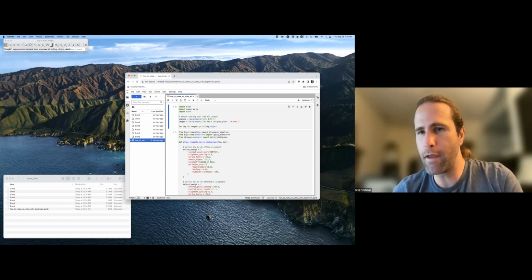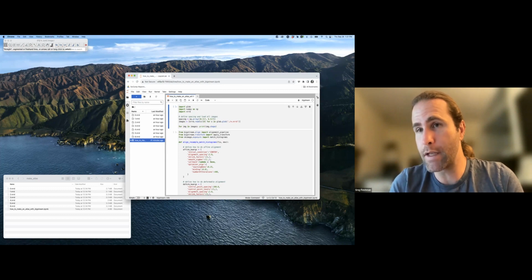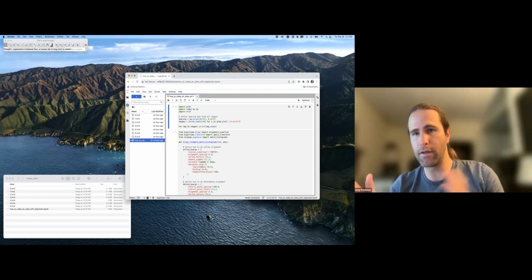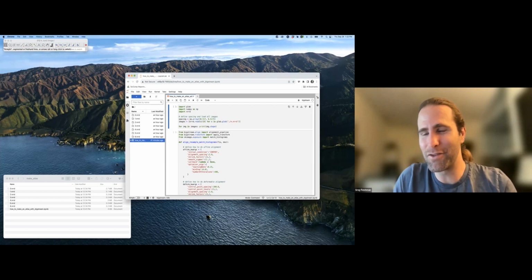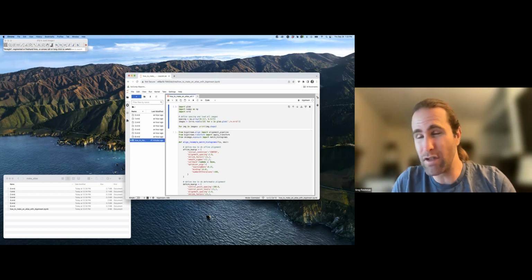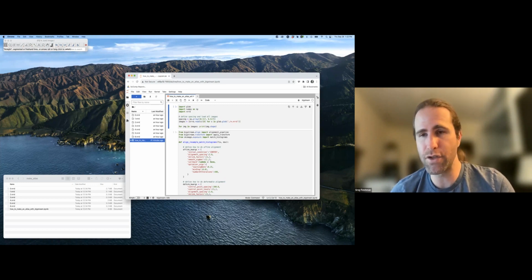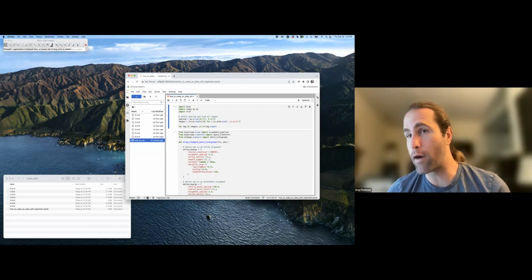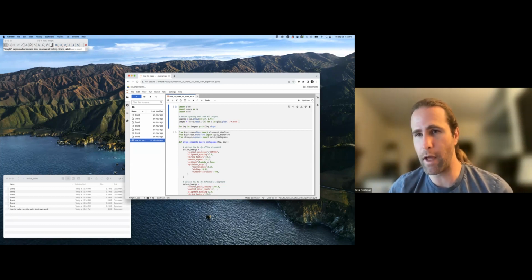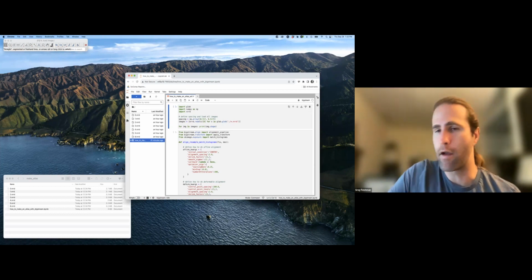And I think if I'm interpreting your question correctly, that process is one where you have to bin things. You have to decide how many bins to use for your histogram. I don't put that much thought into it, to tell you the truth. I just use the default settings for histogram matching algorithms in scikit-image. I think that's usually 256 histogram bins. If you use far fewer bins, or far more bins, you can run into problems in either case.